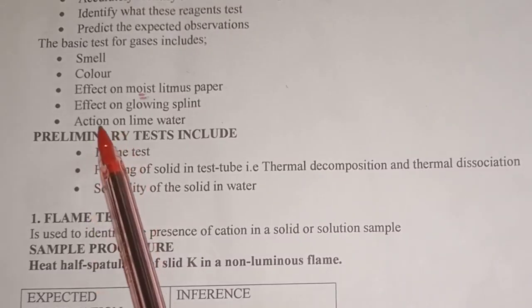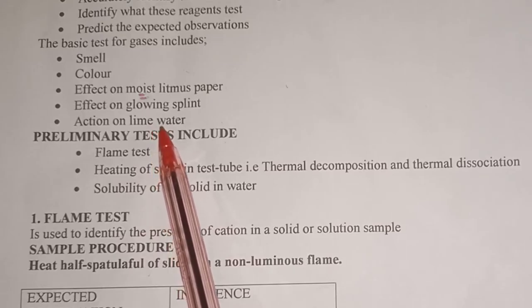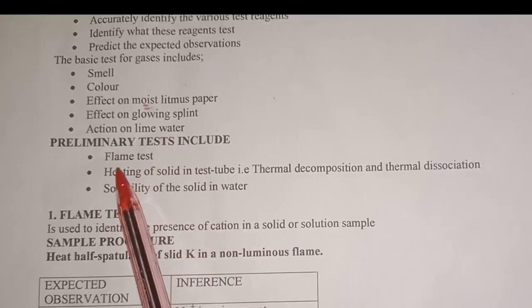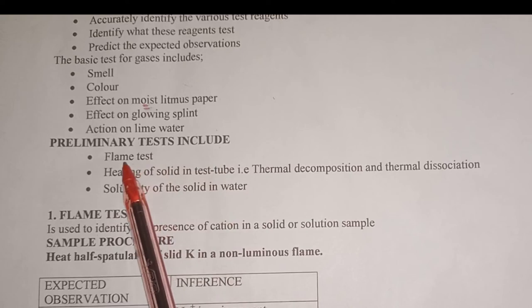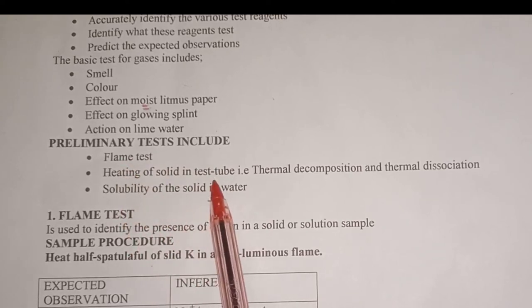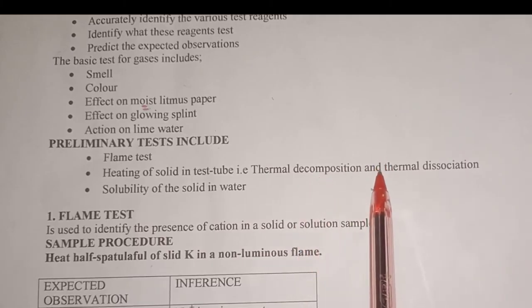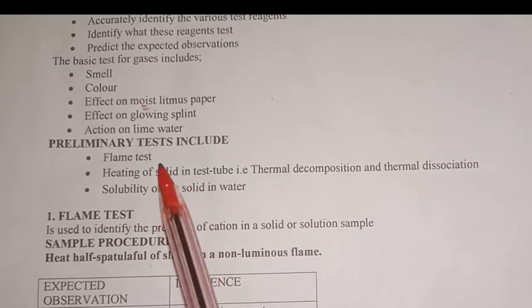The other basic tests include action on lime water. Carbon dioxide is tested by passing it through lime water, that's calcium hydroxide, for a short while, and therefore it forms a white precipitate. From there, you need to know preliminary tests, which usually include, number one, flame test; number two, heating of solid in a test tube or a boiling tube, and that is thermal decomposition or thermal dissociation; and then the third one is solubility of the solid in water.